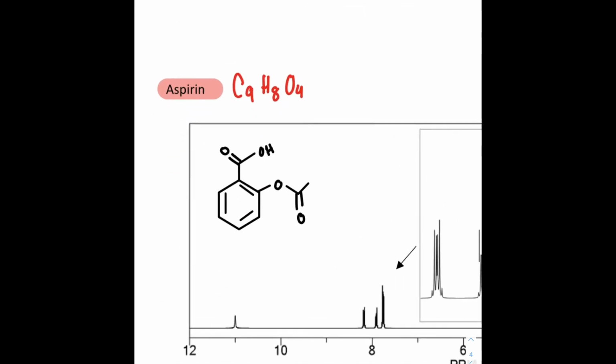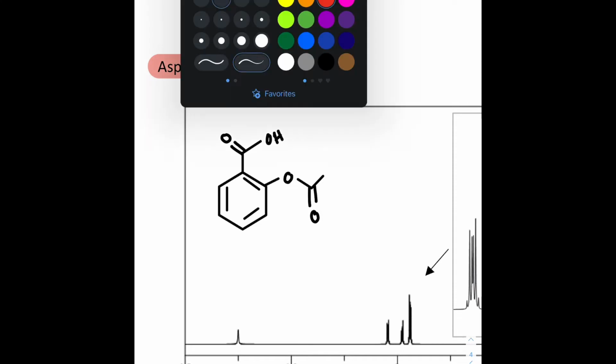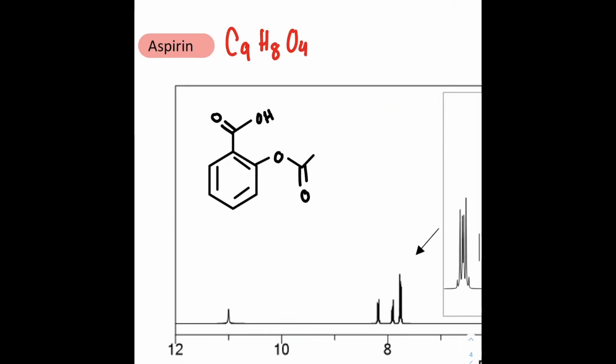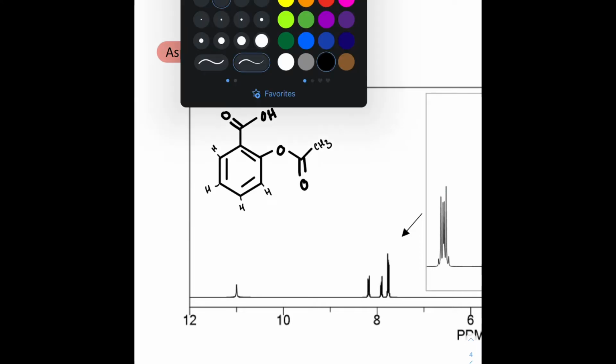So to start with our aspirin, we're going to look to see how many hydrogen groups we can find. So I'm going to actually go in and draw all these little sneaky hydrogens that are around this benzene, so it's easier to see. And then we also have this CH3 right there. Okay, so let's double check. We have 1, 4, 5, 6, 7, 8 hydrogens. So that matches with the formula. So let's now sort these.